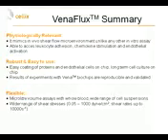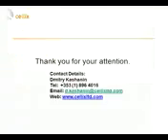The system is very flexible. It requires only microliter volumes of whole blood or different cell suspensions to execute the assay, and it can be used with quite a wide range of shear stresses, from venous to arterial shear stresses.